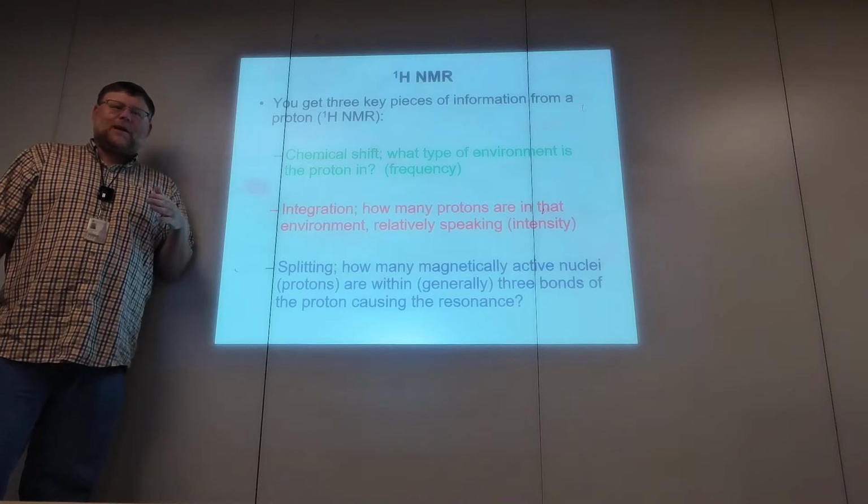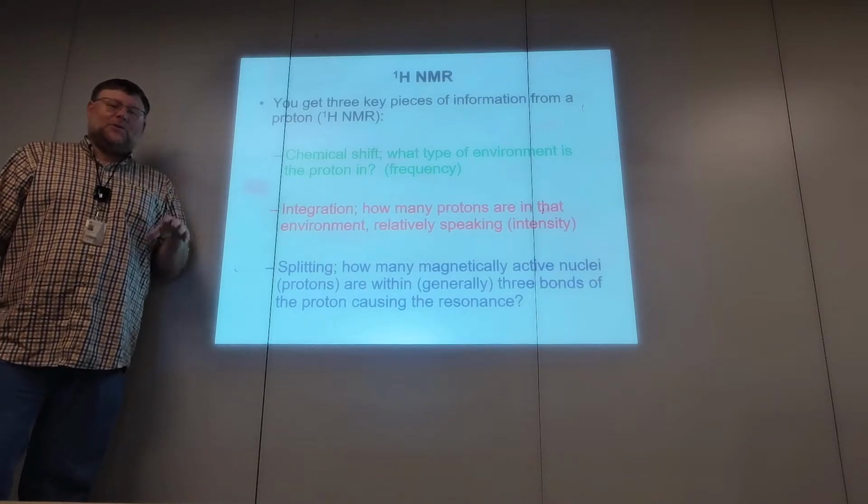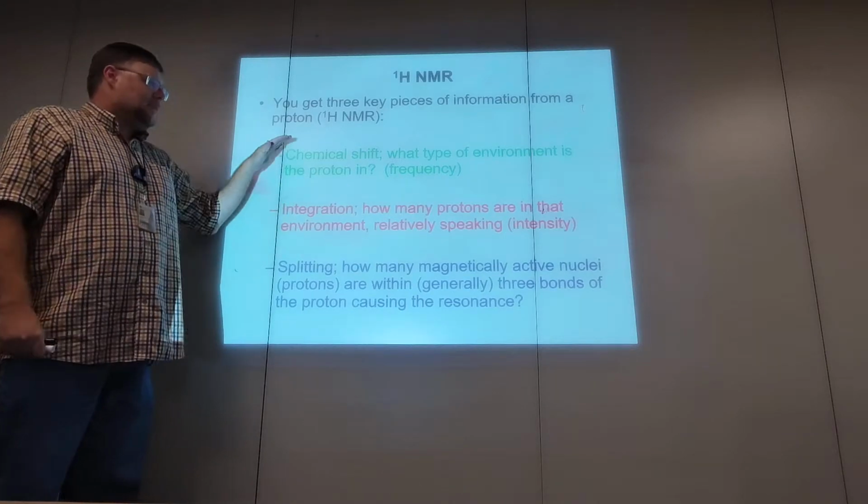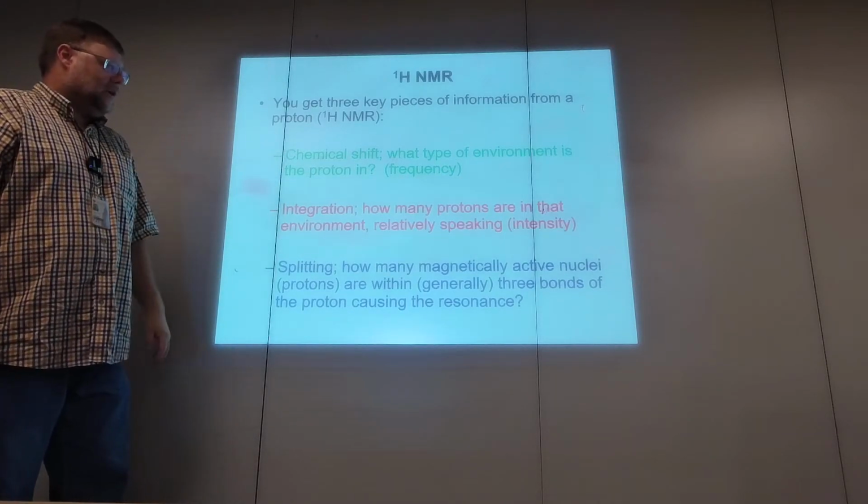If you haven't seen the proton NMR theory video yet, you should watch that, because I'm not really going to talk about how NMR is taken or what it means. I'm just going to go through how we analyze one.